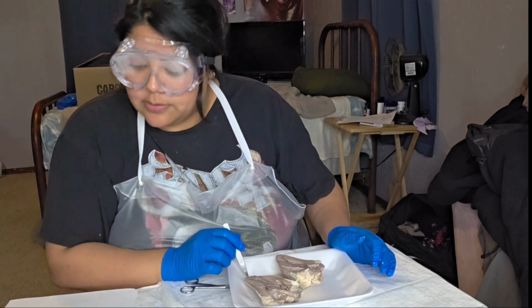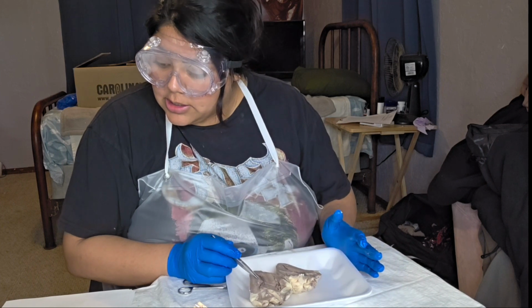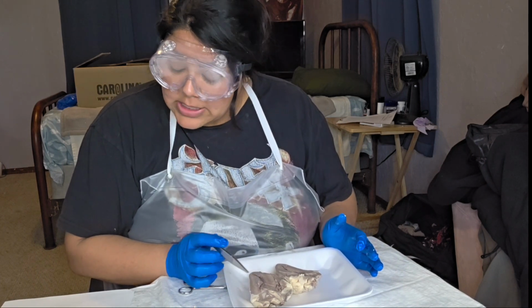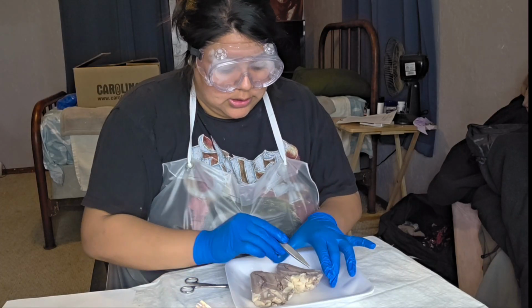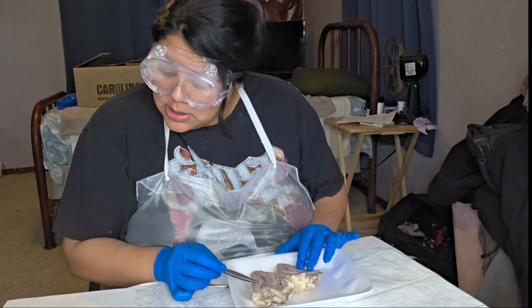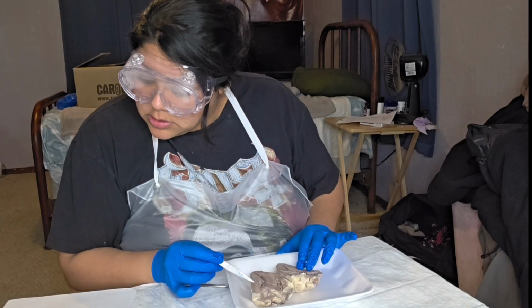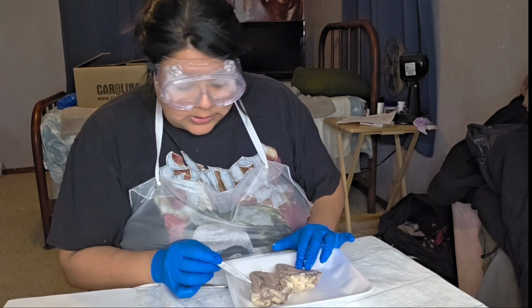And since we already cut open our heart to the other side, examine the left atrium. So that is going to be these two outer sides. Find the opening of the pulmonary vein from the lungs.